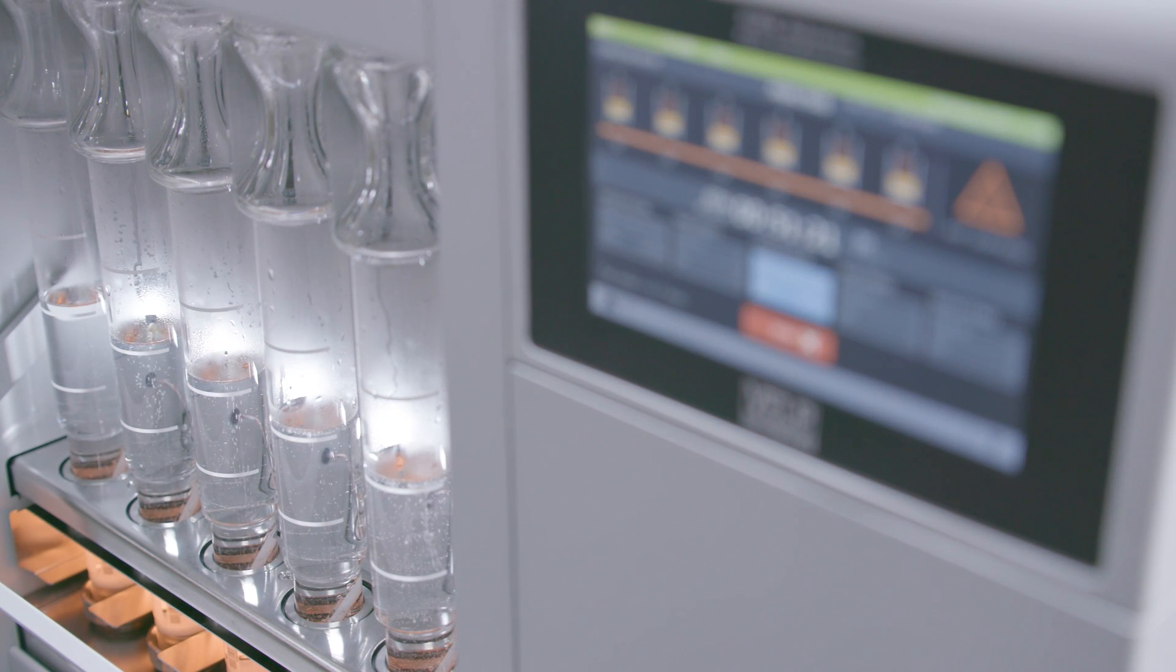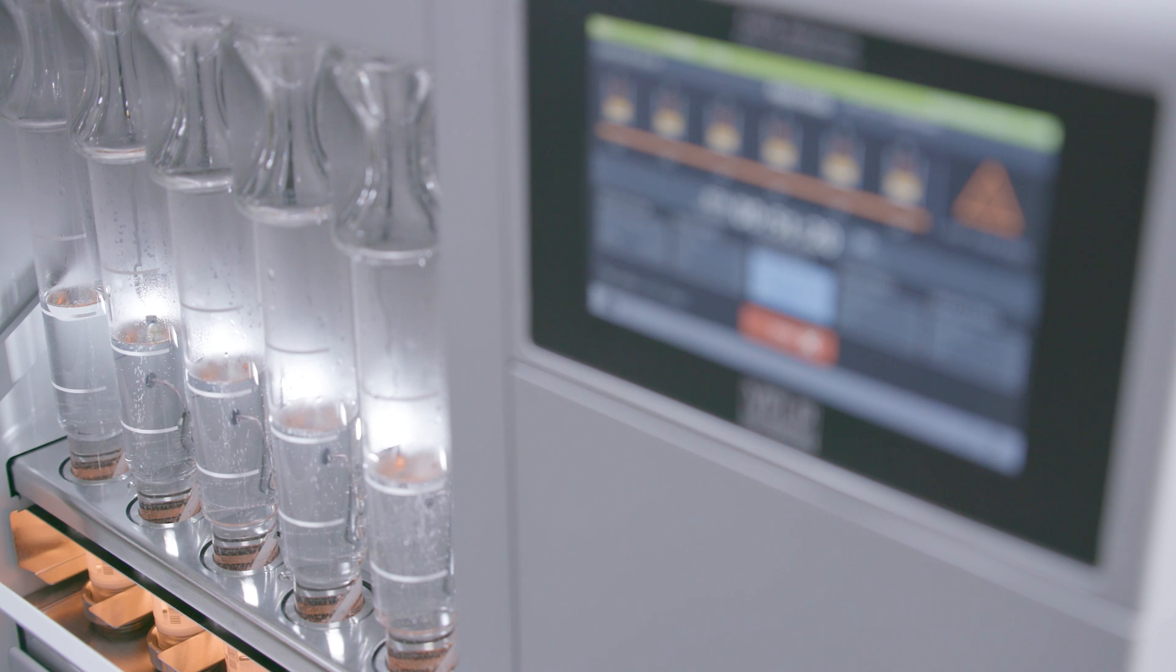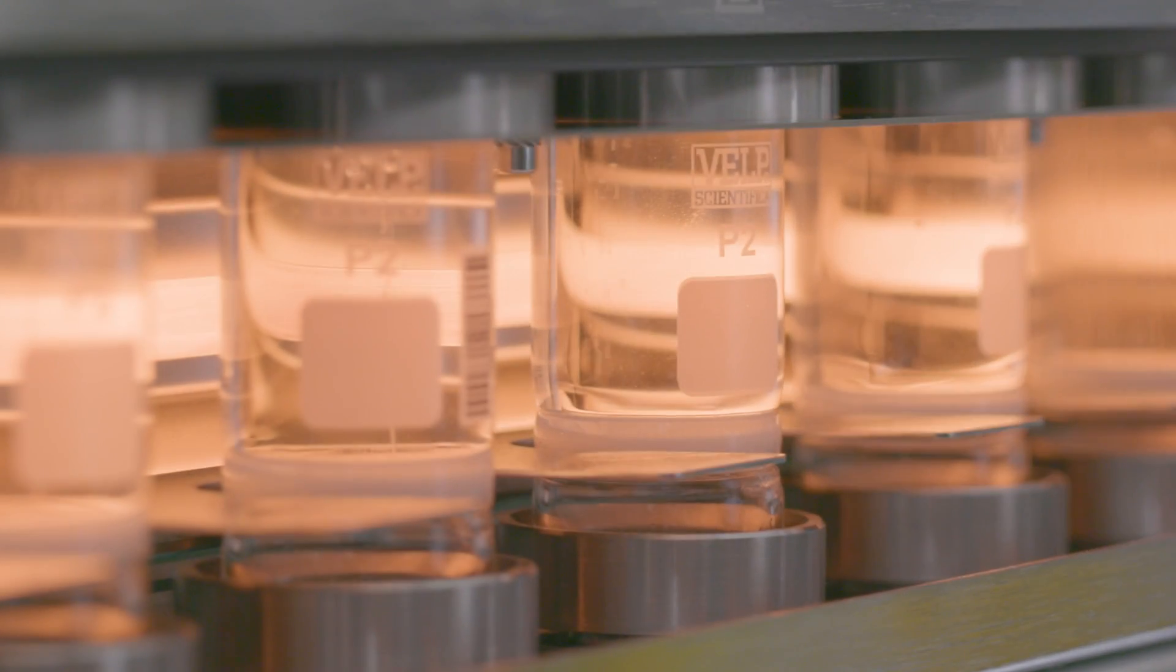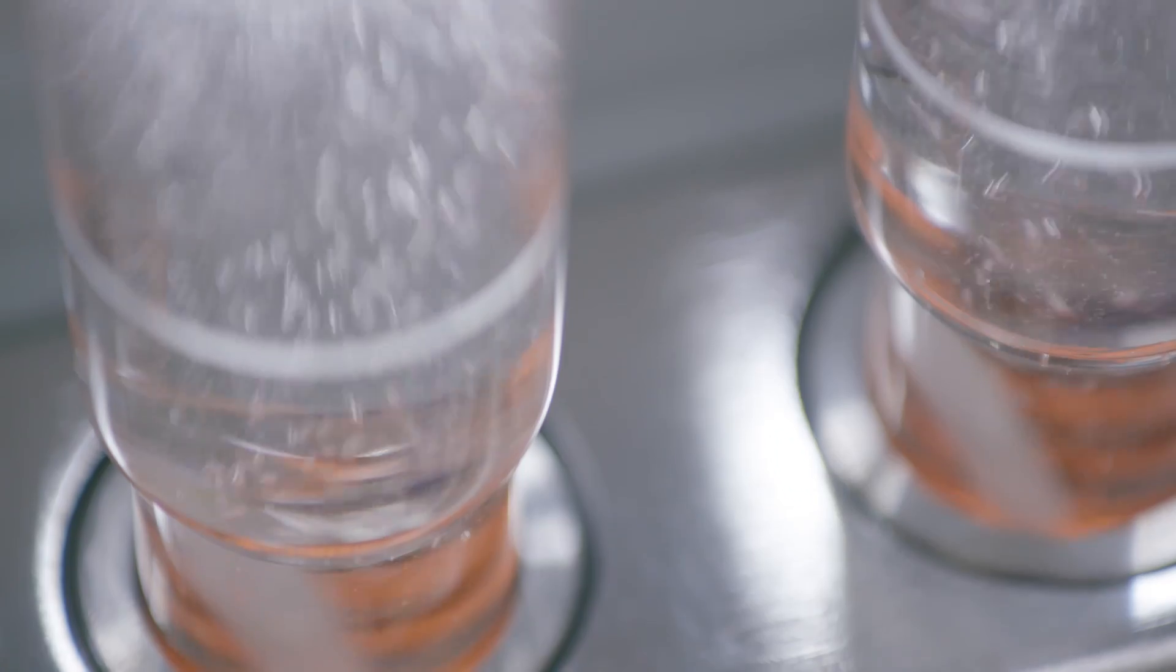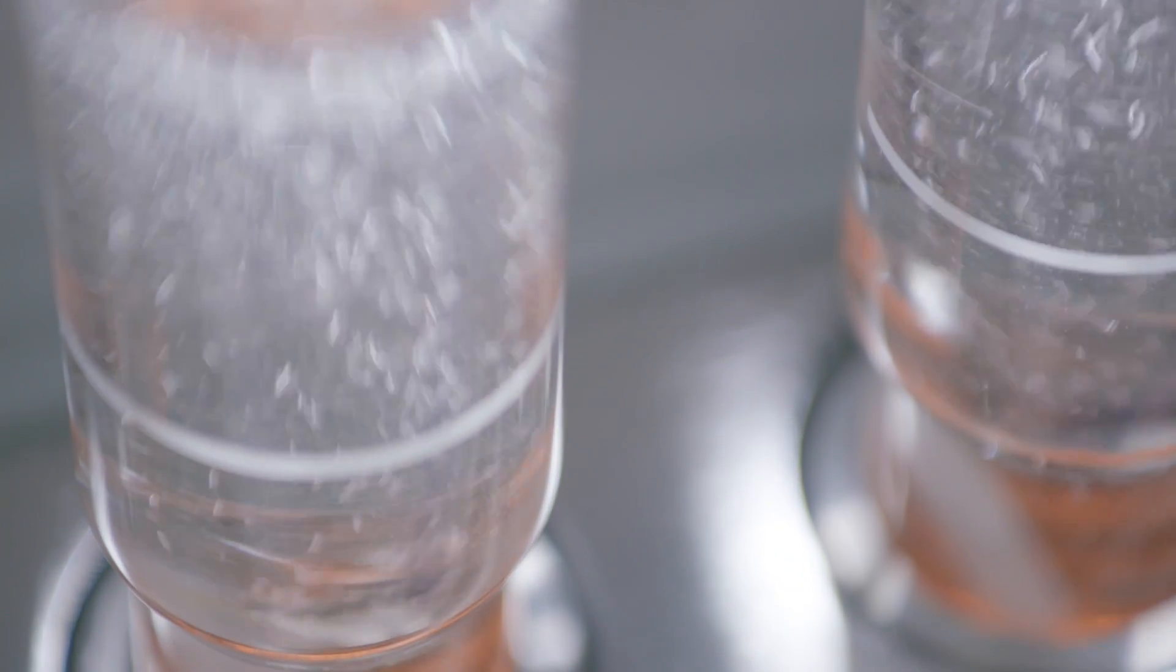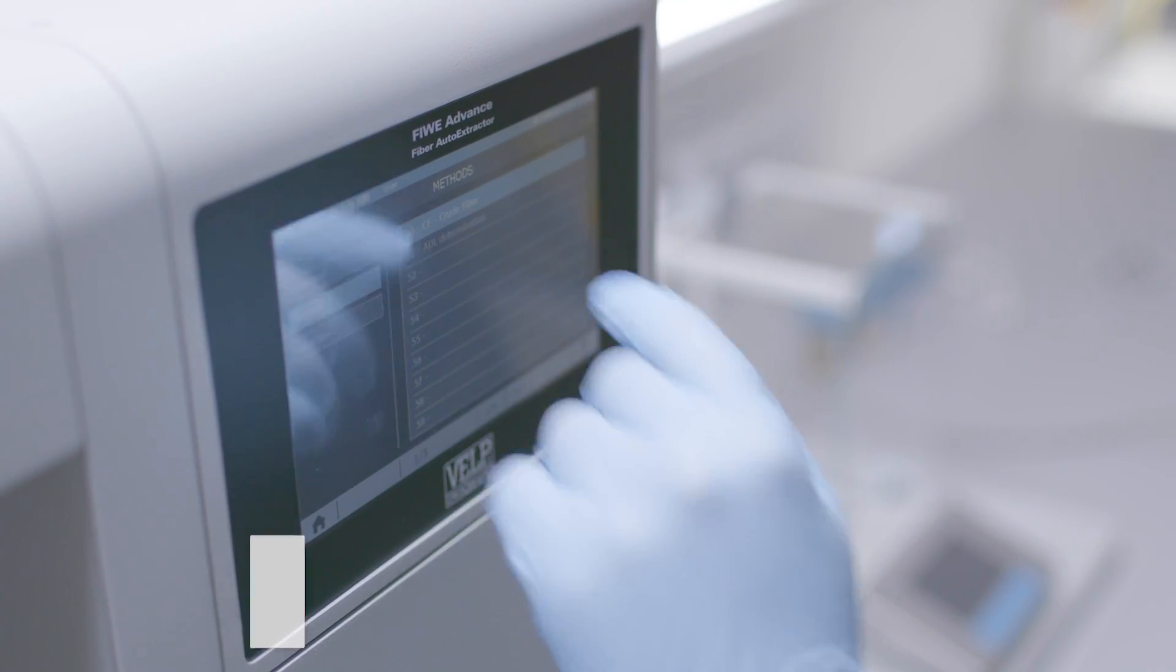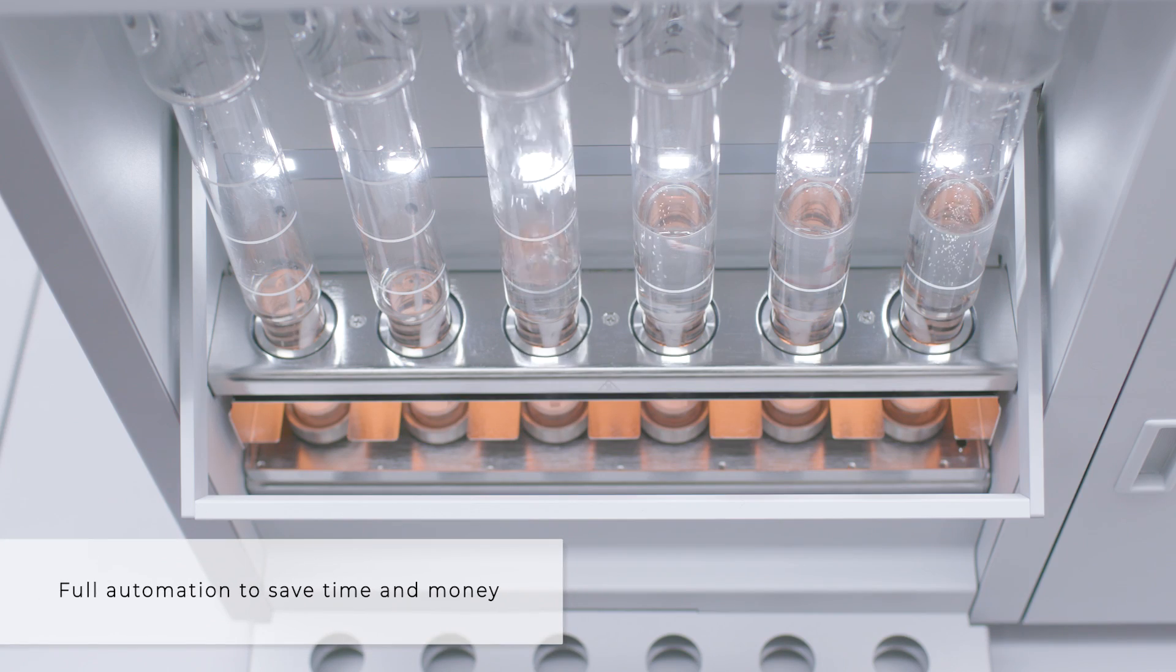Accurate and reproducible results are what scientists in the animal feed industry need for fiber determinations to meet the requirements of product labeling and quality control. VELP has designed the Feeway Advance to provide a solution to save time and money through automation.